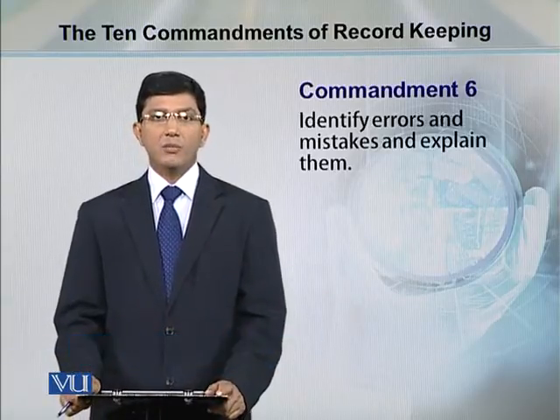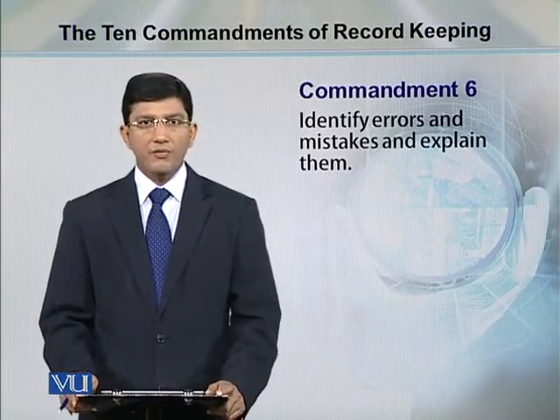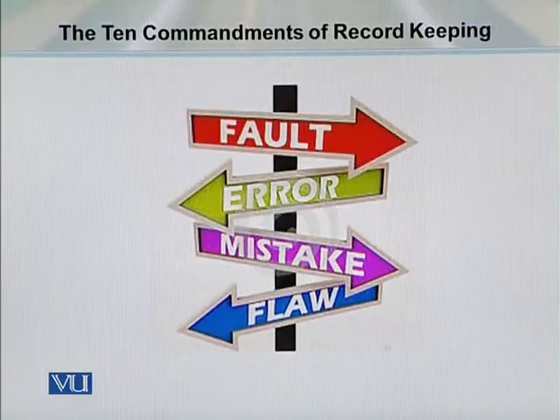In case your experiments fail, in case the experiment doesn't work properly as per your understanding, then find out the faults, mistakes, and explain them. For example, you try to do a gel electrophoresis of some samples, but the electrophoresis fails due to no separation of the proteins or DNA or RNA. There can be a number of factors. Buffer composition में फ़र्क हो सकता है, pH different हो सकती है, electrical current में fault हो सकता है.